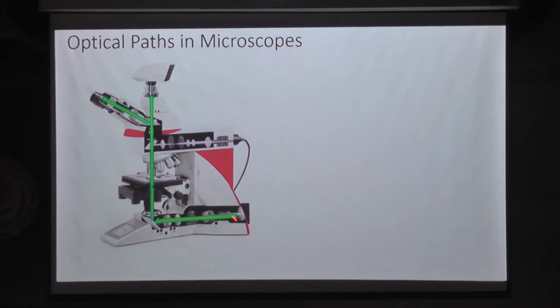So this is a 100-watt light source kept at the back of the microscope. Even with a 100-watt source, the light has to be balanced. It should not happen that the one who is on the microscope has more light and his eyes will pain, while the rest of the people have balanced light. That complexity is also reduced with the help of filters.